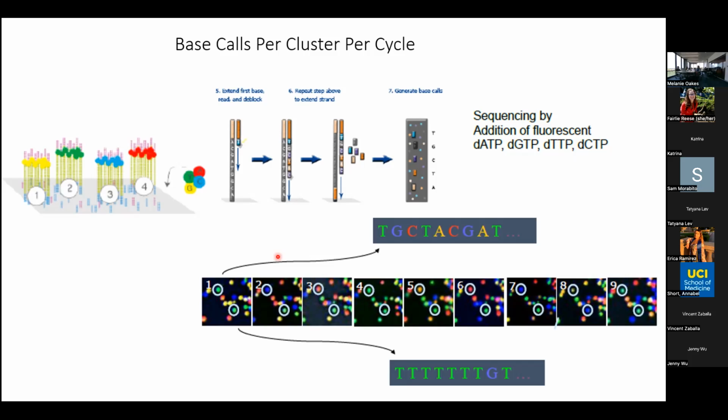Or if we're talking genomic DNA and you're coming to me with a human sample and you want 30x coverage, I'm going to do a calculation where I take 3 gigabases times 30, which gives me the number of bases. Then I divide that by the number of bases we're going to sequence to get the number of reads. And it's about, I think, 500 million, something like that. Right. Yeah.